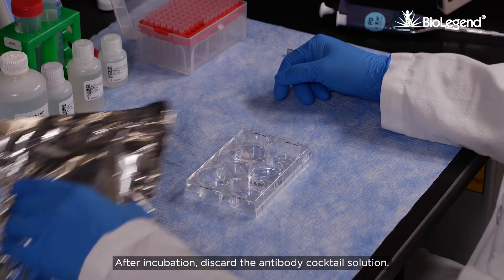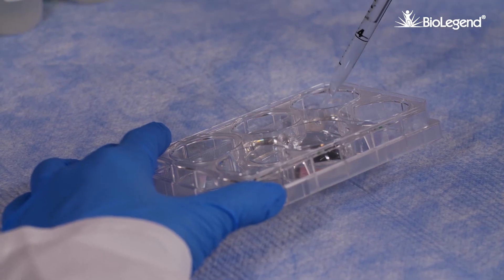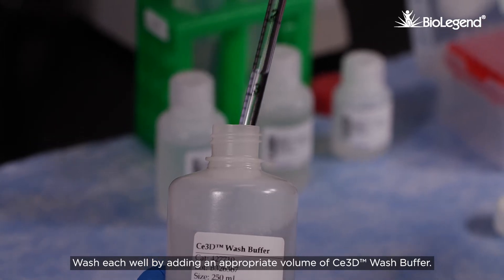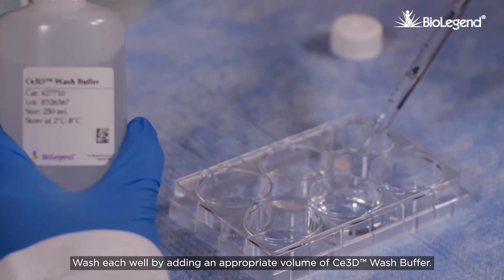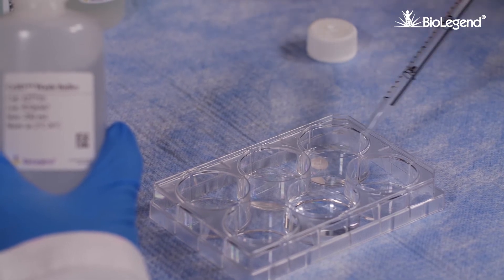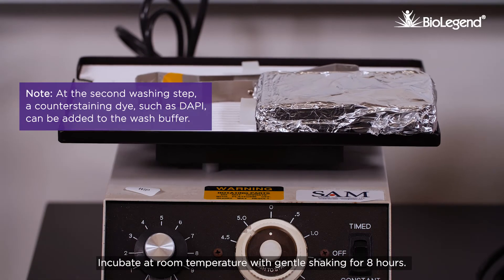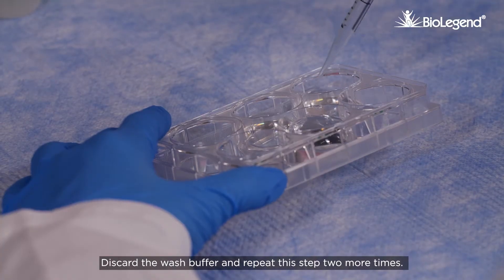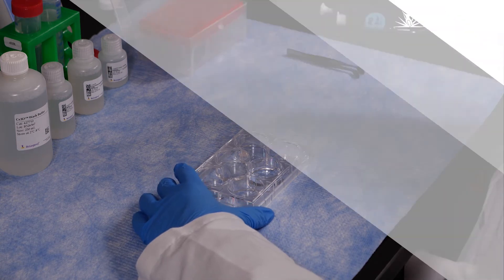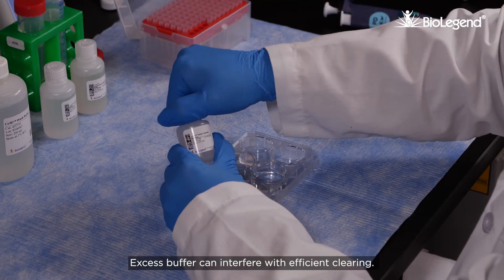After incubation, discard the antibody cocktail solution. Wash each well by adding an appropriate volume of C3D wash buffer. Incubate at room temperature with gentle shaking for eight hours. Discard the wash buffer and repeat this step two more times. To prepare for tissue clearing, completely remove the wash buffer from each well, as excess buffer can interfere with efficient clearing.